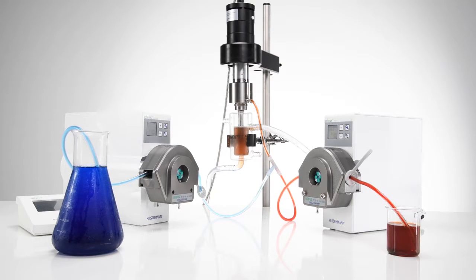During the process, the two substances are led directly through the probe into the intense cavitation field at its tip, where they are homogenized.